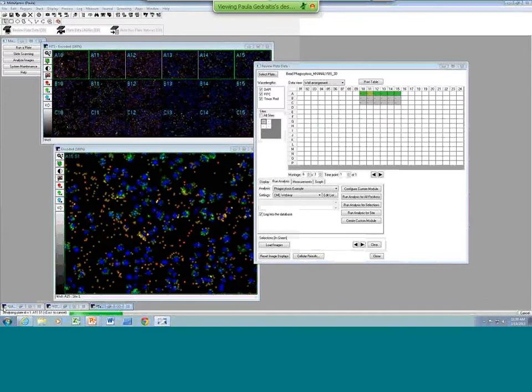And you'll see it's running through. It runs nice and quickly, much quicker than most of the custom journals that you might have tried in the past. And this is not running PowerCore, so with PowerCore it would run even faster.